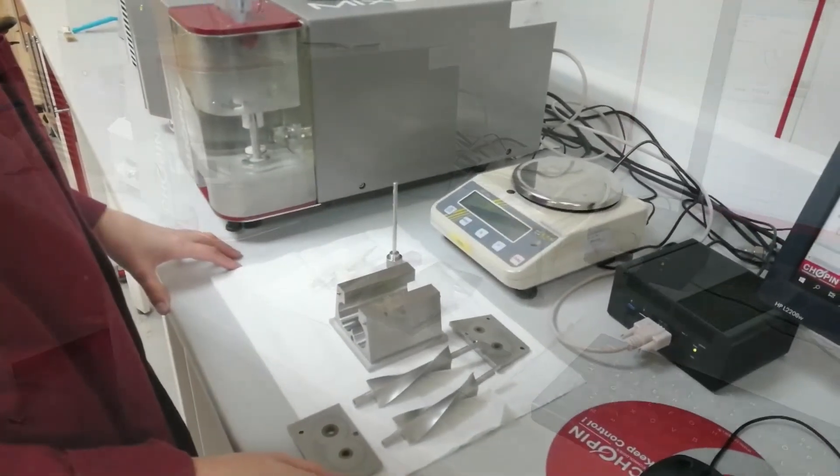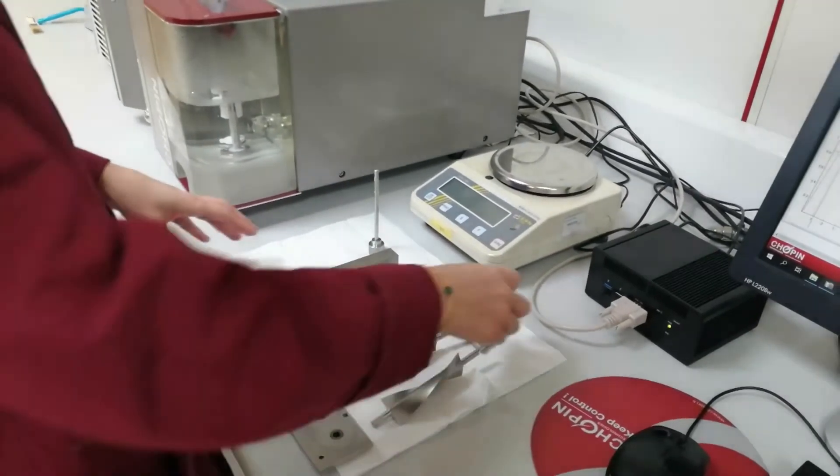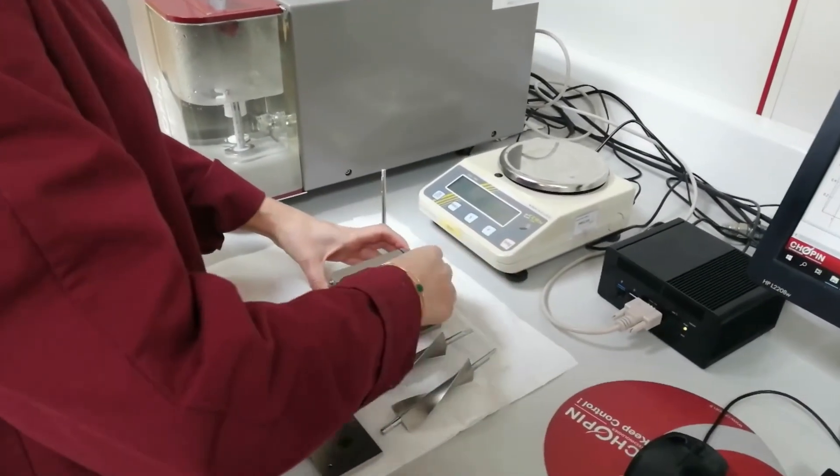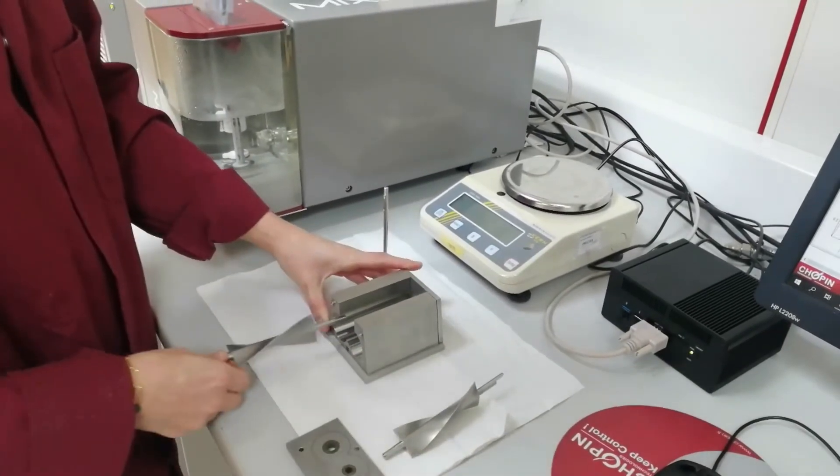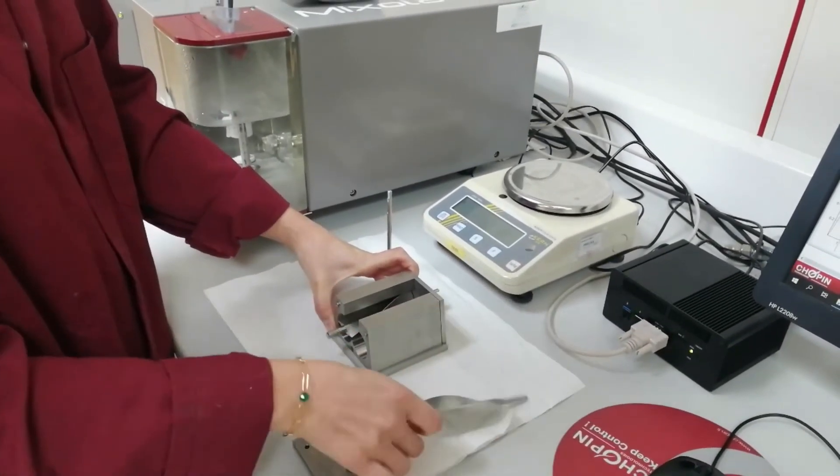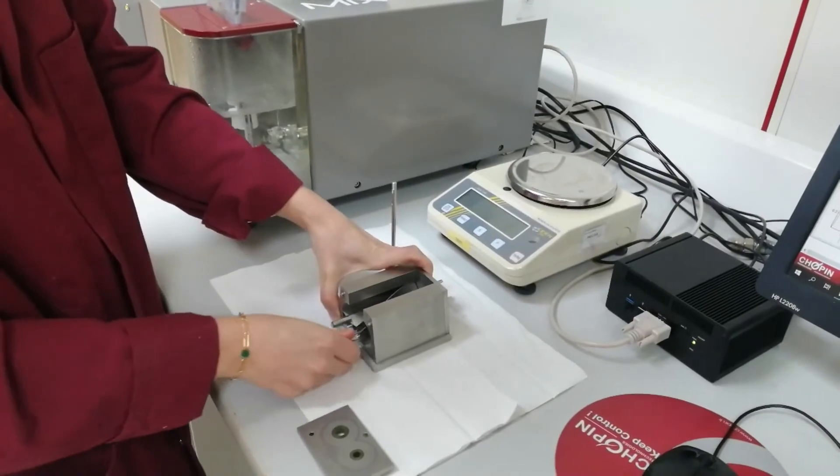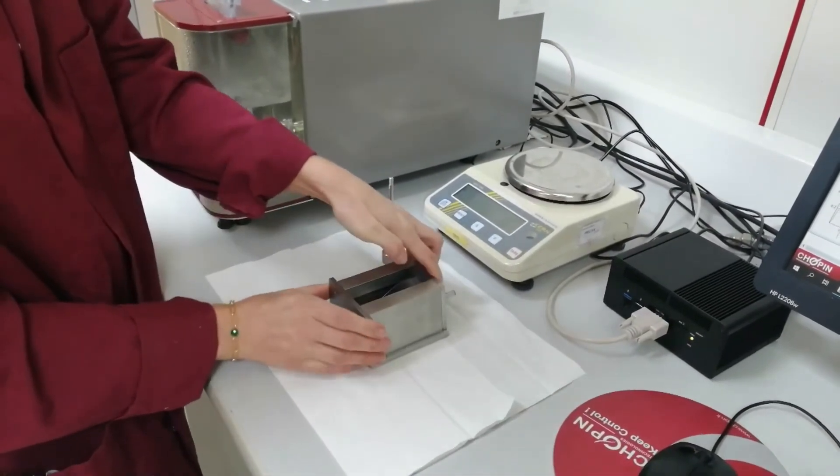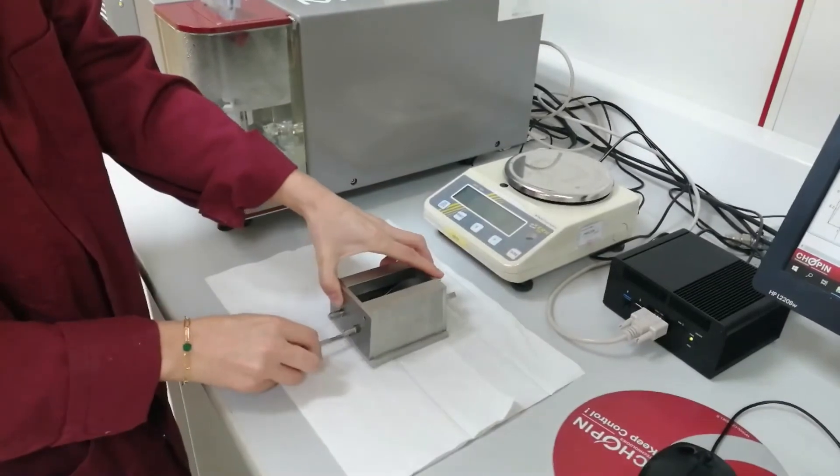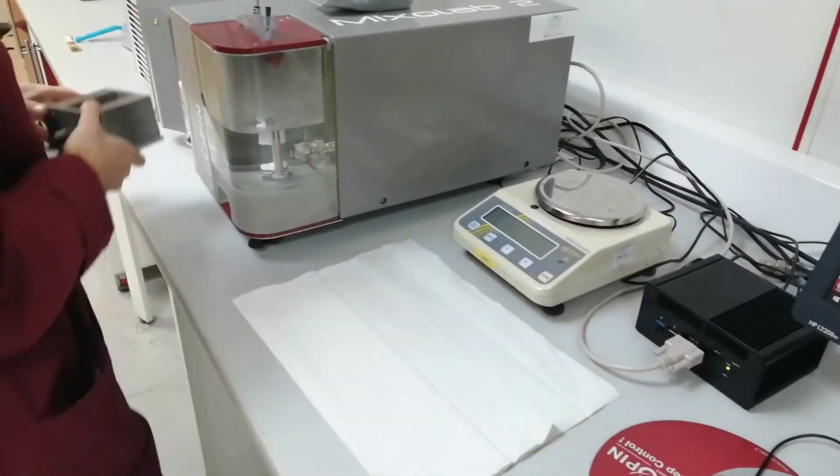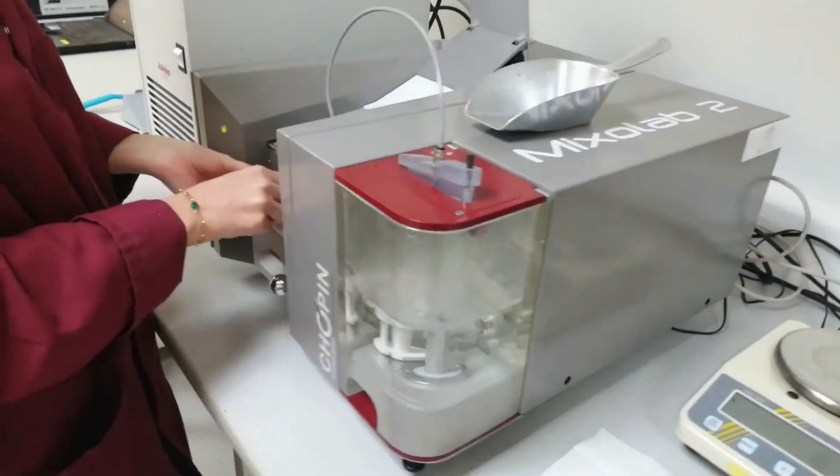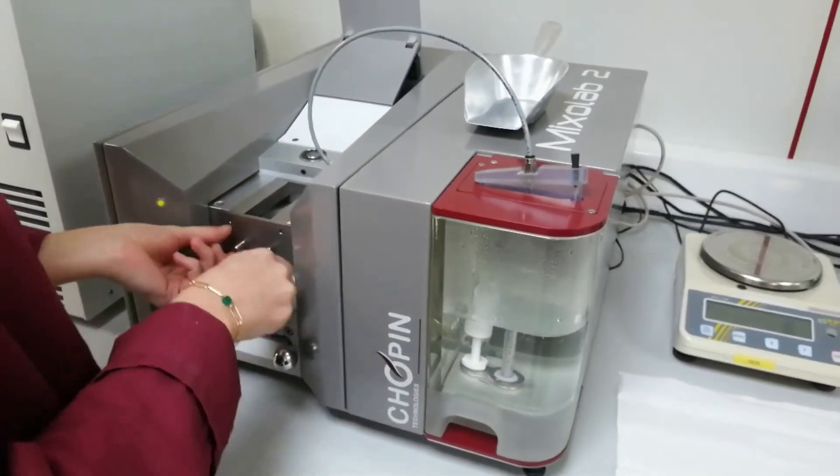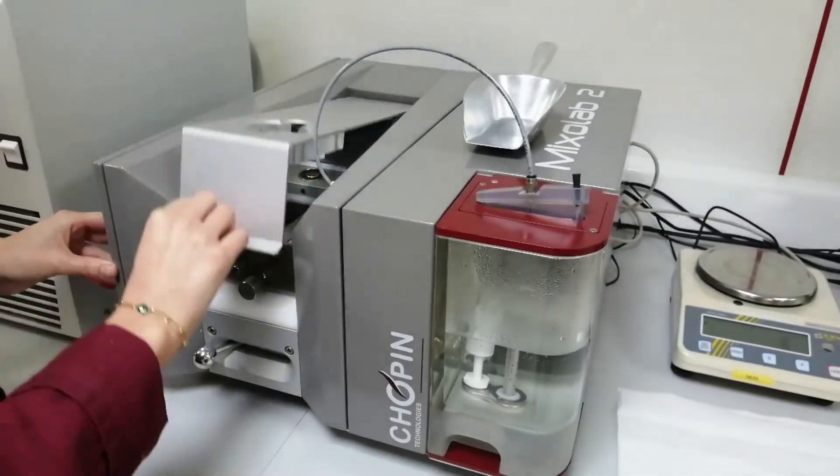Once all is clean and dried, you are going to reassemble all the parts. Finally, you will put it back at this position and you will lock it moving the locking handle to the left. The device is ready for running another test.